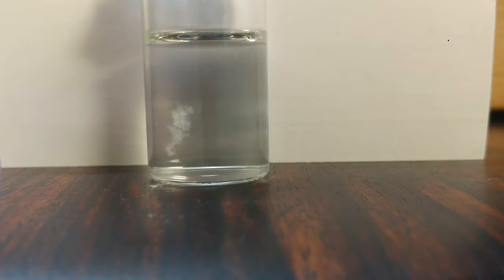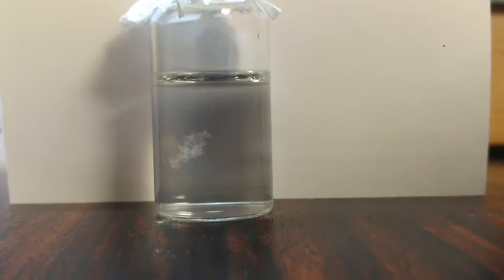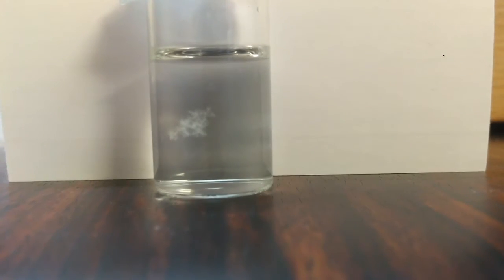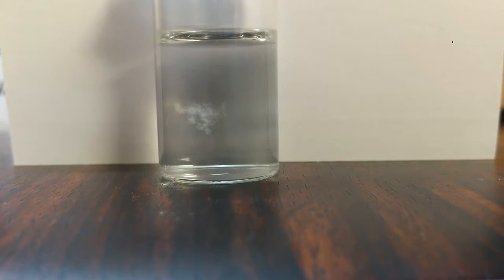Looking at the current growth, as you can tell, there is a significantly less amount of water in our vial than last week. I am approximating that we've lost about half a centimeter of water. Because my vial is in my room, I think that may be slowing down the rate of evaporation and thus the rate of the formation of our alum crystals.